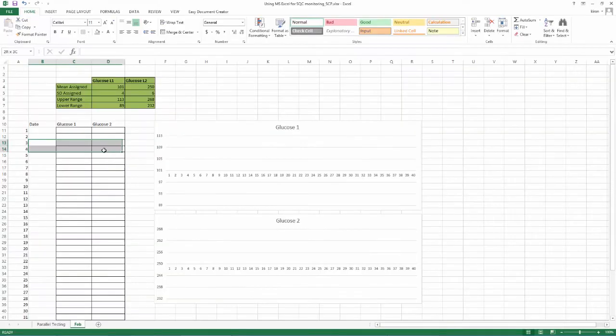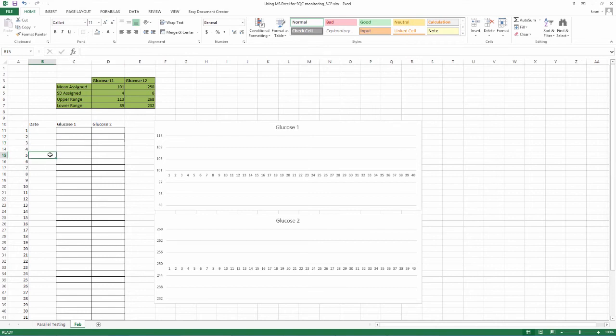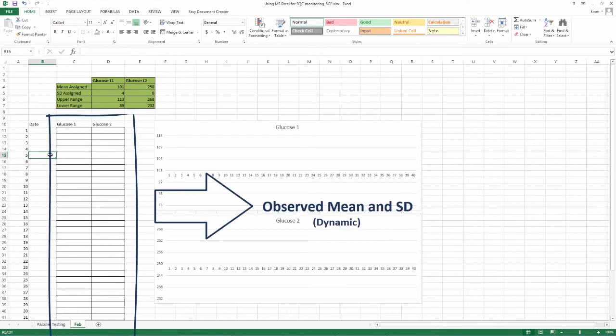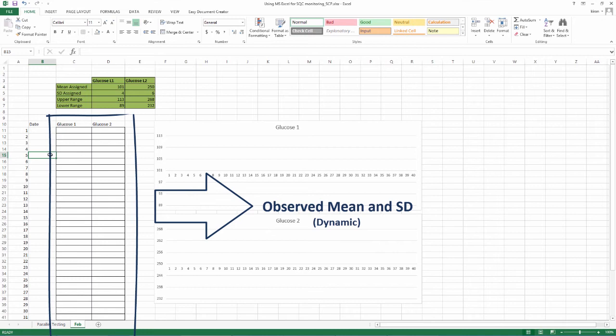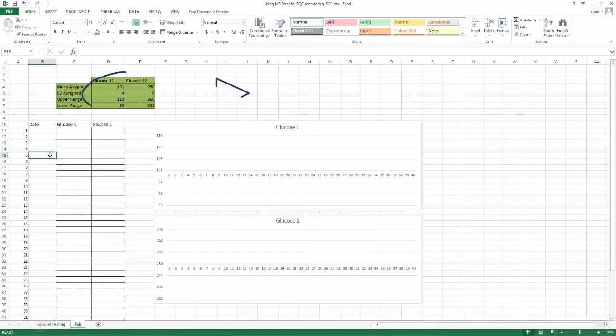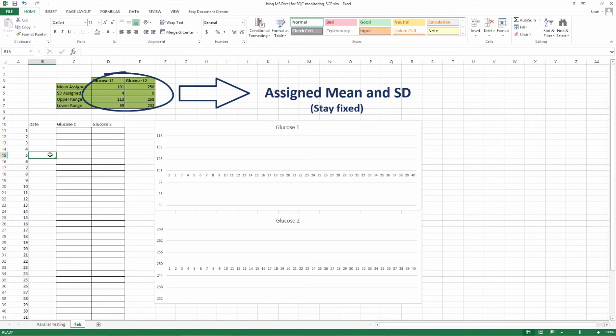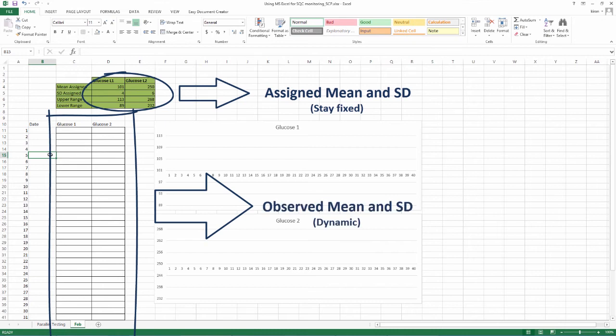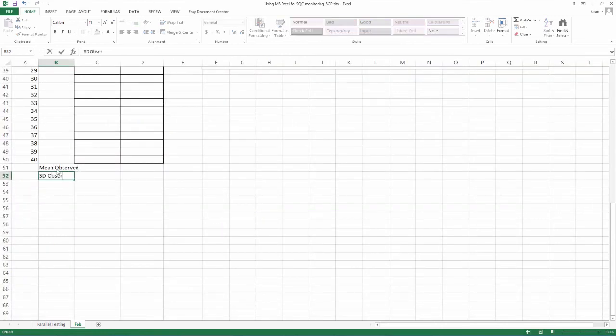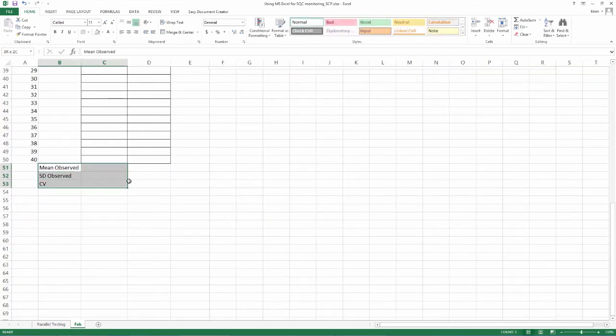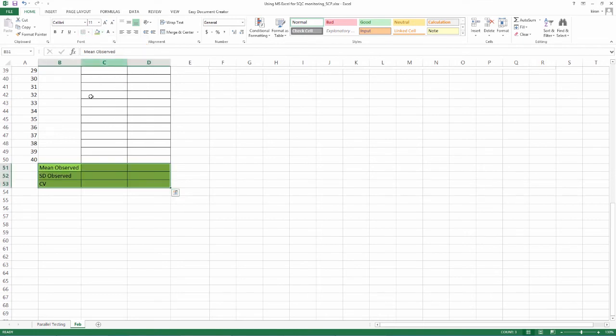You will also note the date in the column assigned for this. Whenever corrective actions are done, there will be more than one entry per day or run. Alongside the graphing, we also need to understand the status of mean and SD in real-time. Let us call these our observed values for mean and SD. The graph will tell you the story mostly, but it would also be good to look at the developing numbers. Make 3 entries at the end of your 40 rows for observed mean, SD and CV.